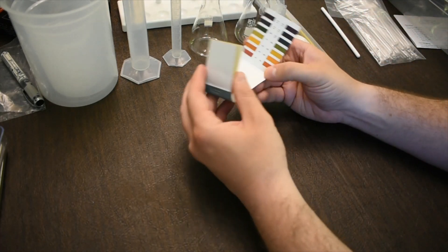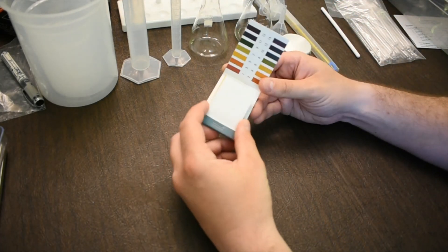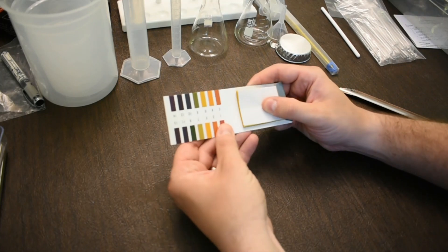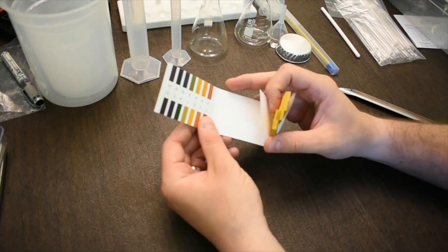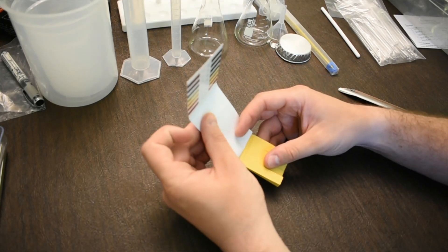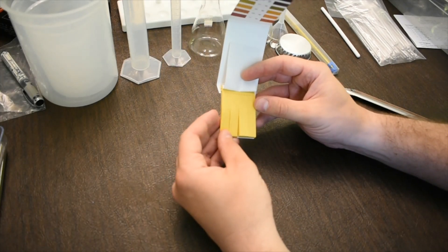We also have pH paper. When you open it up, there will be a colored scale that tells you what the different pH values correspond to, and then there are individual pH paper strips you can rip off and use.